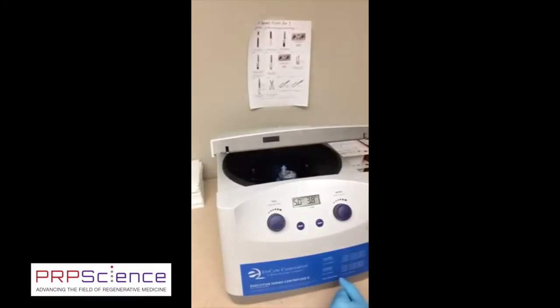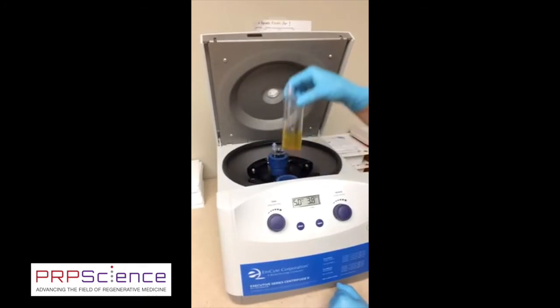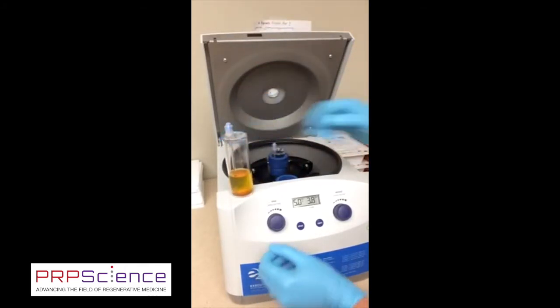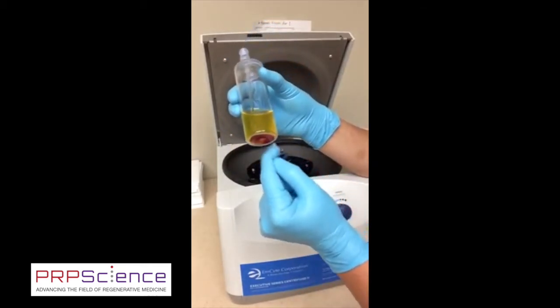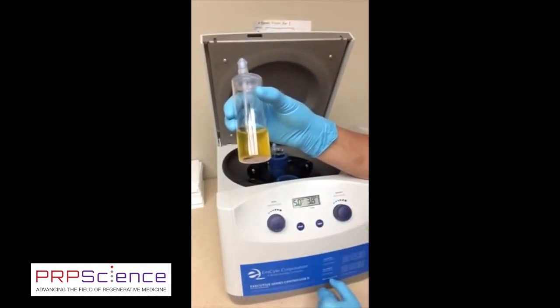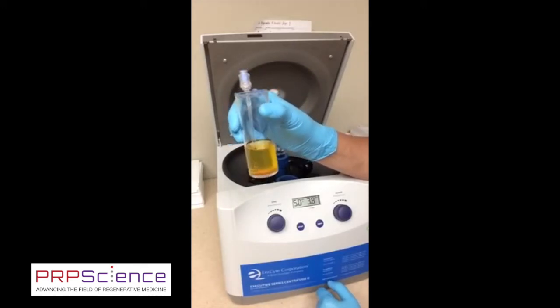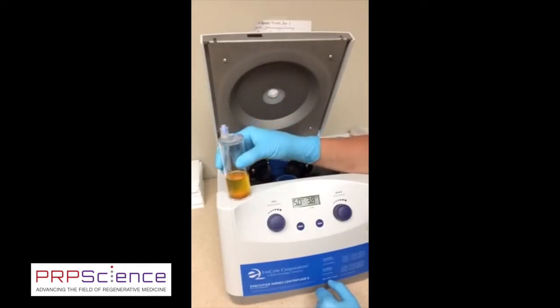Okay, here we are after the second spin. Doors open automatically, and I take my conical out. Now, you can see at the bottom that all my platelets, my buffy coat, is at the bottom and it's stuck on the bottom. And that's the way it should be, that we actually have a very nice buffy coat at the bottom.